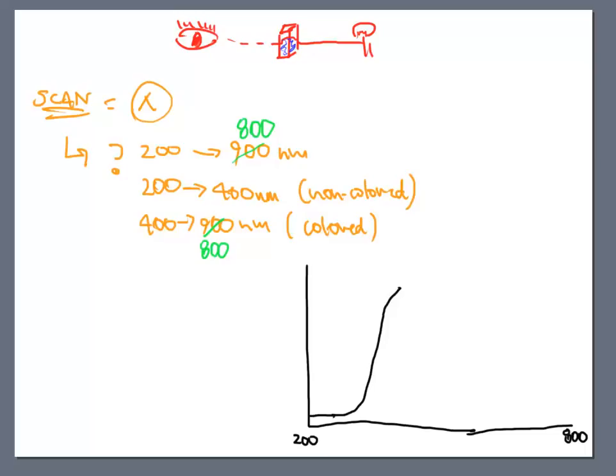So I'm showing you that on the computer screen. I'm telling you that as I go through this window, I'm getting to a point of the buffet line that the molecule really likes what I'm offering, and we see a huge spike that goes up on the graph.